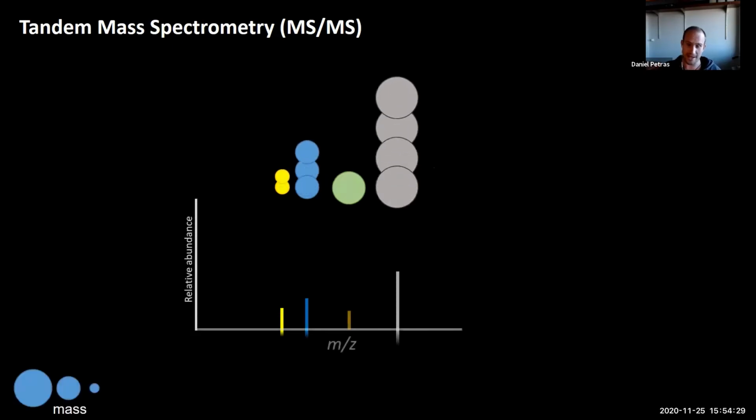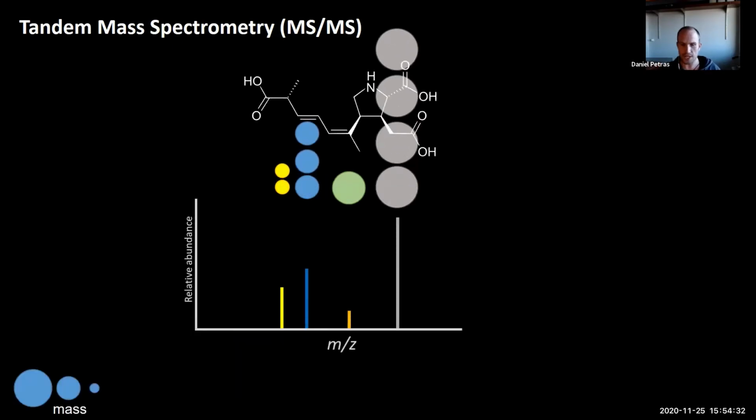That is really exciting because the fragmentation is typically according to the structure of a molecule. Here, the weakest bond would typically break. If you have a peptide, that's typically the amide bond. And if you have some other interesting molecules, it's typically the weakest bond. So you can make sense out of that and use this to propose a structure de novo, which is hard. More commonly, you can use this fragmentation pattern to record the spectrum in a spectral library and then simply match your experimental spectra later on against this library.